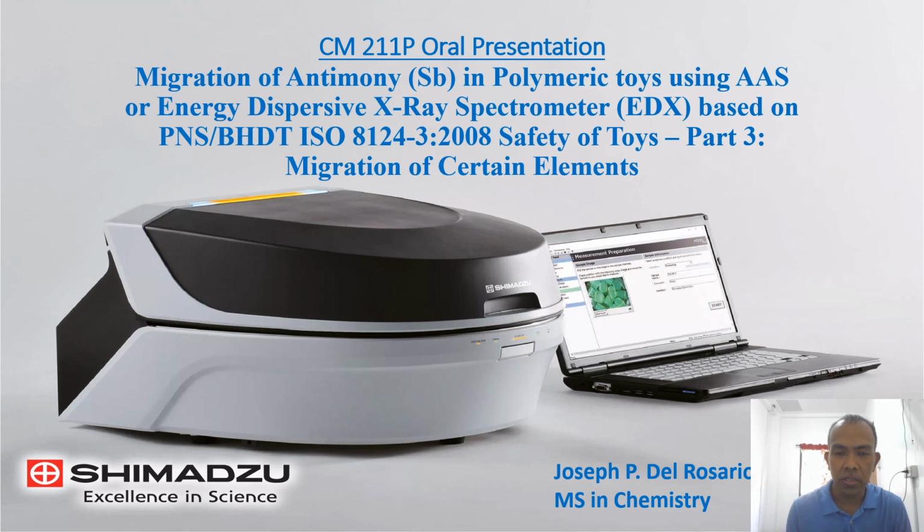So this study is solely based on this procedure. Ito yung gamit namin in our office, the official method, PNS BHDT. So I analyze antimony. So far, we have validated four metals in analysis of toys, especially in polymeric. We have validated lead, cadmium, arsenic, and mercury, but antimony is yet to be done.